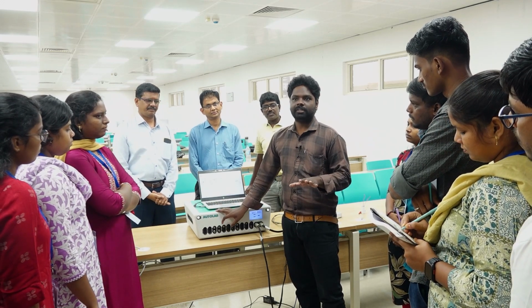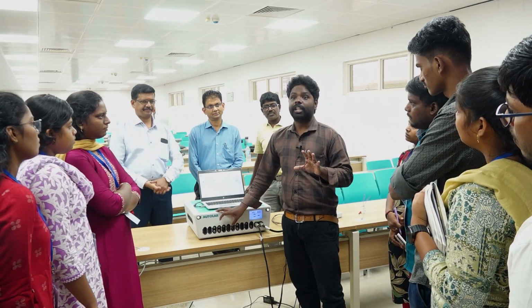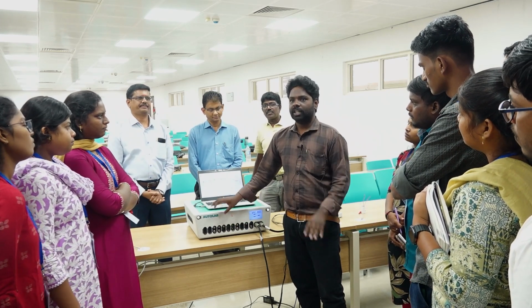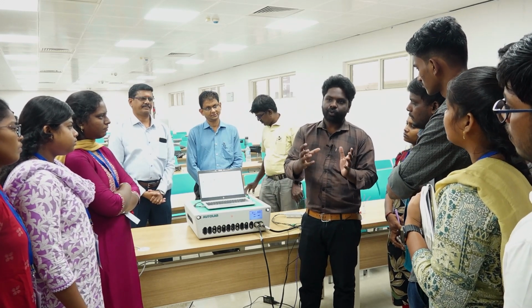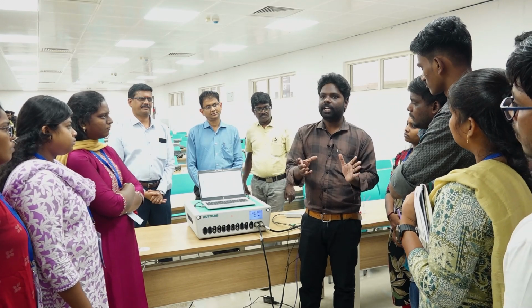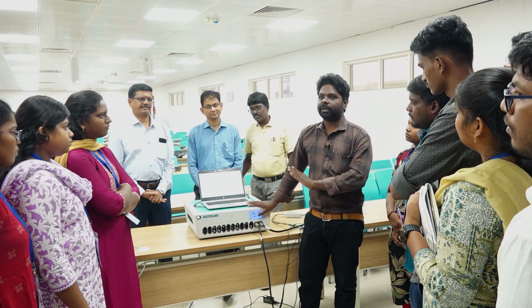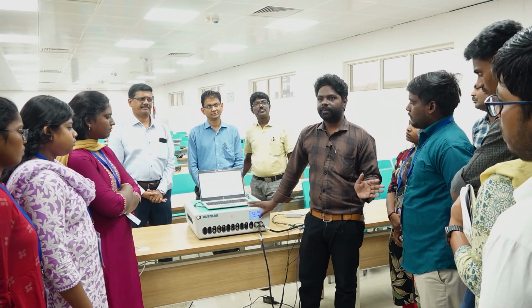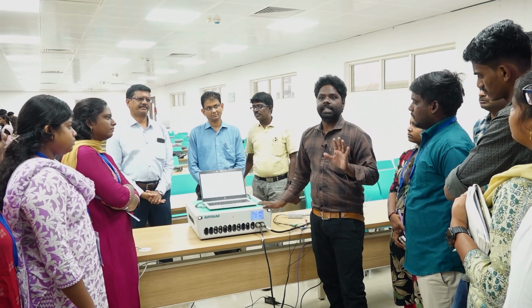Nowadays many analyses require an electrochemical process. If you want to characterize or analyze a material, we need electrochemical equipment. This is one of the electrochemical equipment from the Metrohm brand. Today we are going to cover EIS.